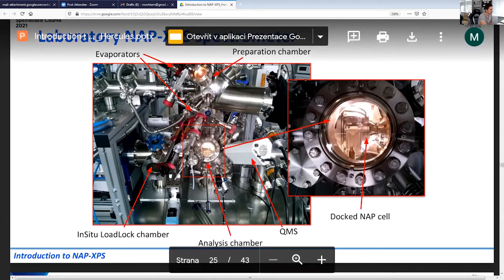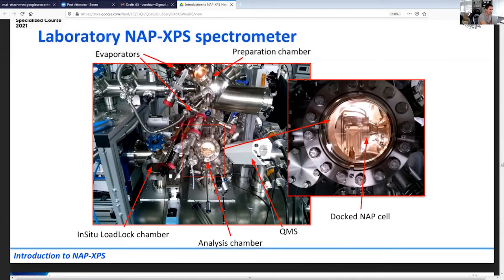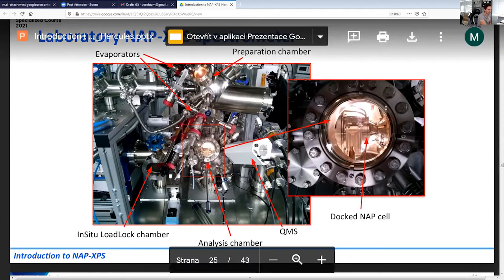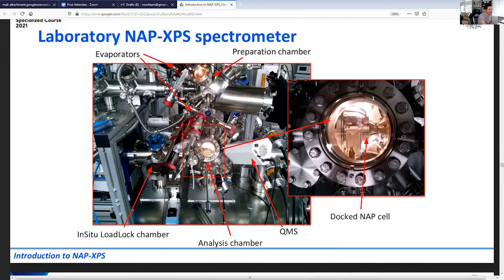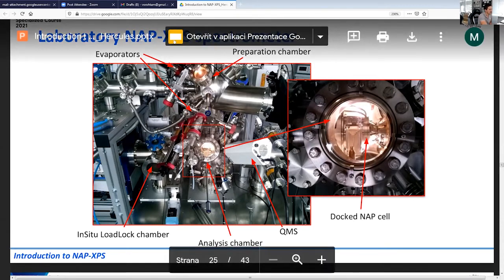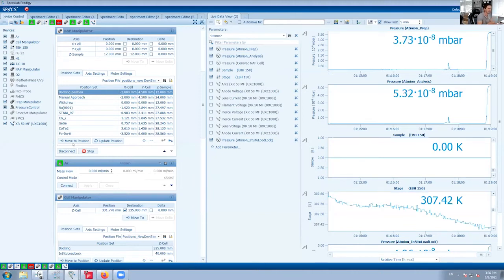It is this wobble stick which you use for opening the door, I mean, this connection, and for taking the sample. This is a bit of the UHV manipulator scene, which was moved up by 10 centimeters, the same as Brett did just seconds before. So now, when the cell is close to the analyzer, we can go back to this screen and try to do this docking, to connect the cell completely to the analyzer and to lock it.